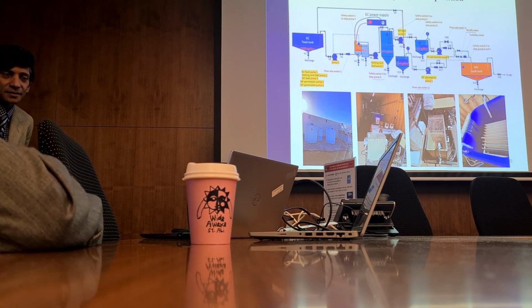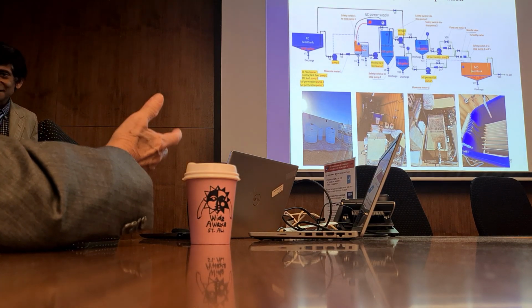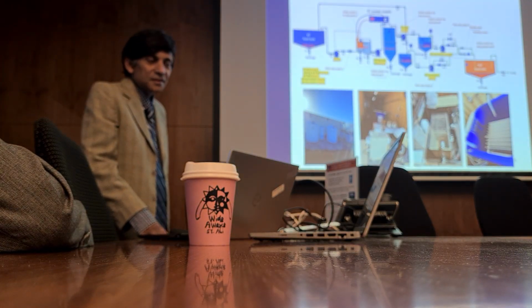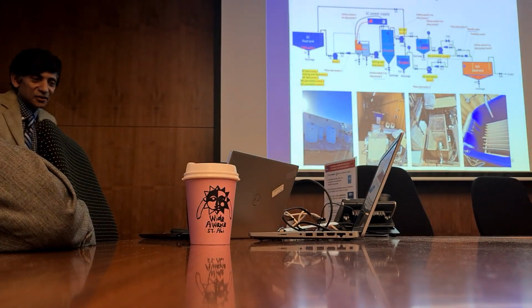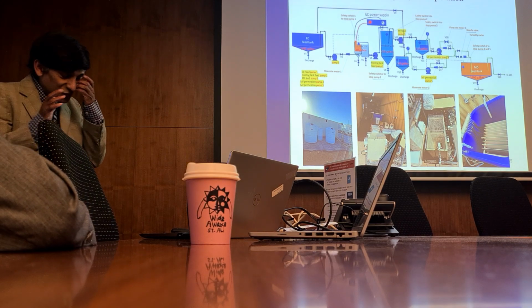If you are using vacuum, then that's going to add to the cost. Was there any fouling problem for the PVDF membrane? Yes, that's why a lot of our work on the upstream pre-treatment was very important, because PVDF does foul.